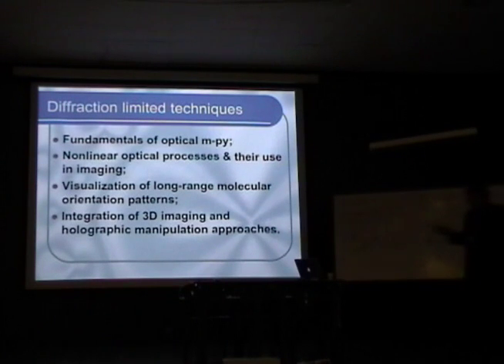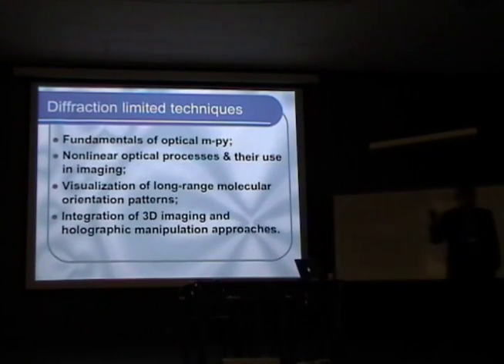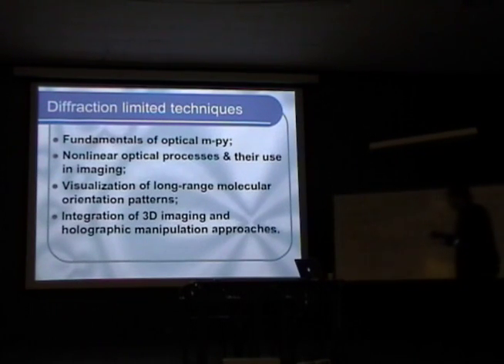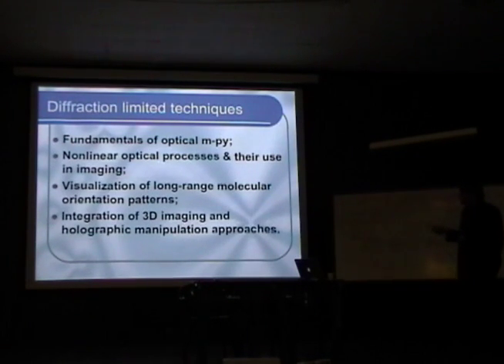I'll start from introducing the fundamentals of optical microscopy in general, because during this week we'll have a number of talks on imaging approaches of different kind, and I think it's generally very useful to give this kind of introduction. Then I'll introduce different nonlinear optical processes and how they are being utilized in different nonlinear optical imaging techniques.